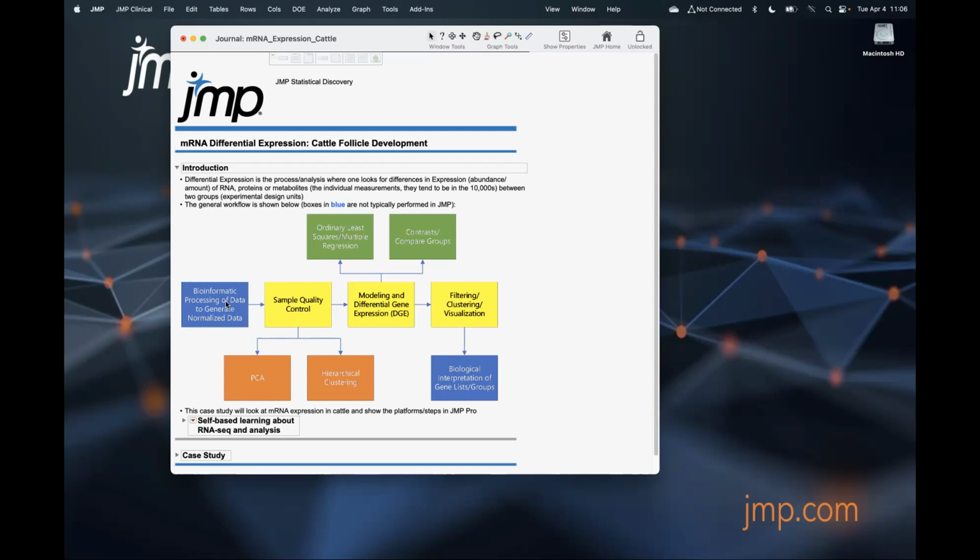So you're going to start there. And you've probably already done some sort of read quality control. You've filtered through read depth. You've already looked at the number of transcripts and mapped to the transcript level, so what have you chosen for your gene model? All that's been done up to this point.